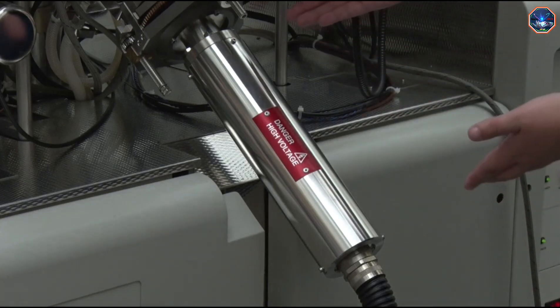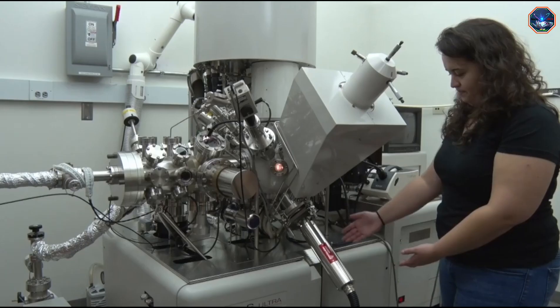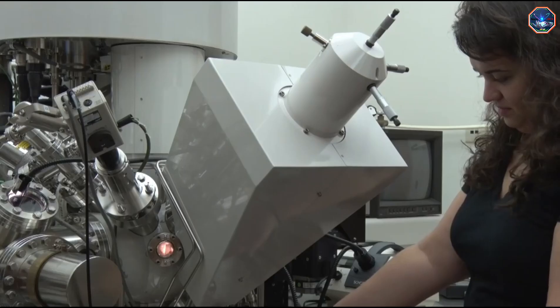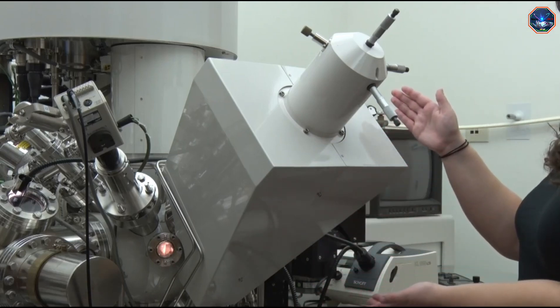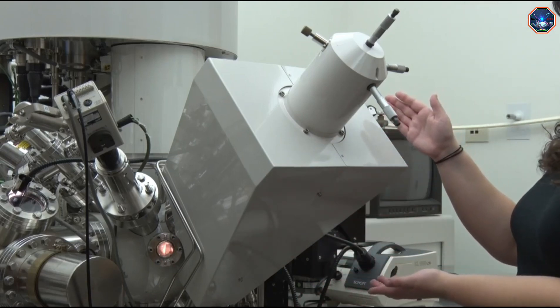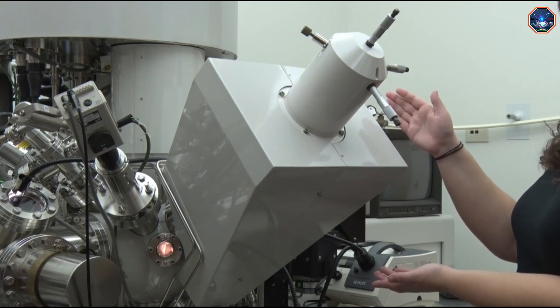This is an aluminum X-ray gun that produces X-rays that then travel up through a monochrometer. The X-ray gun produces X-rays at a couple of different energies, and the monochrometer selects just one energy of X-rays and allows them to travel to the sample.